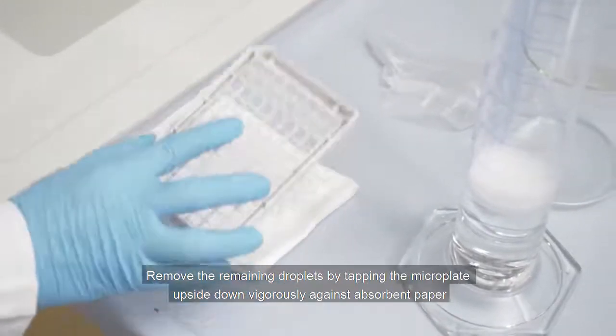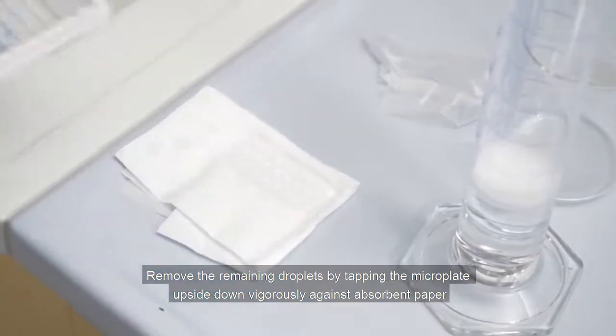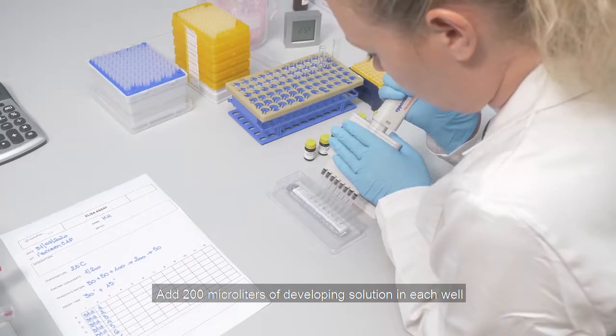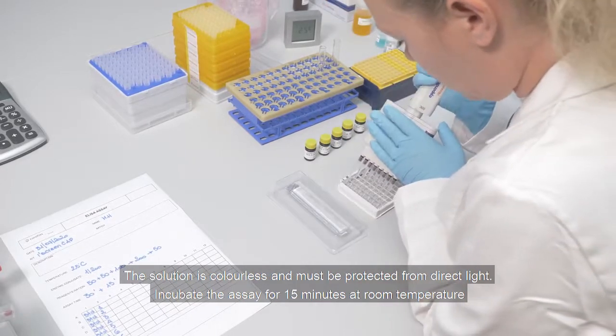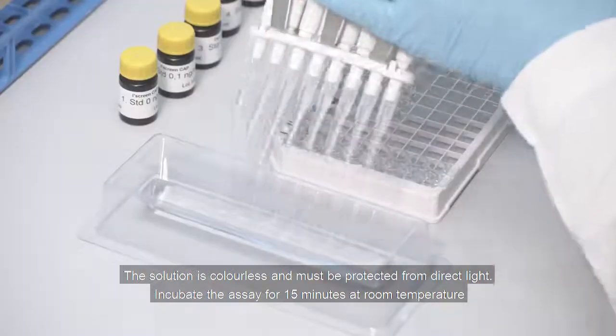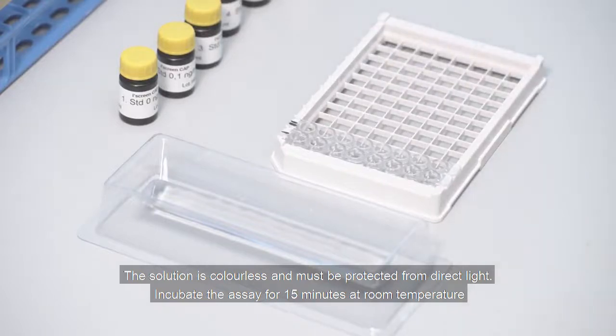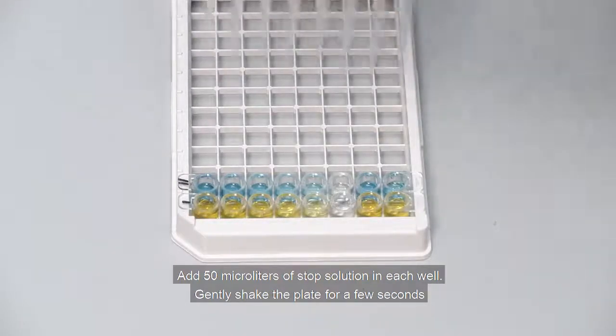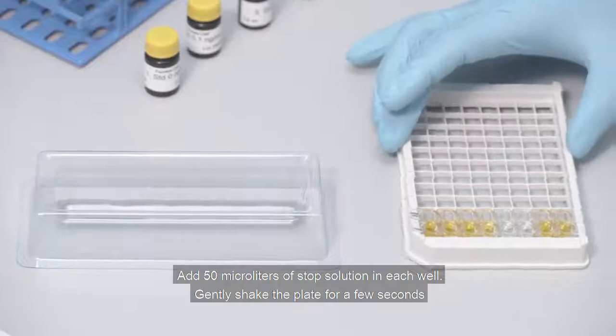Add 200 microliters of developing solution in each well. The solution is colorless and must be protected from direct light. Incubate the assay for 15 minutes at room temperature. Add 50 microliters of stop solution in each well. Gently shake the plate for a few seconds.